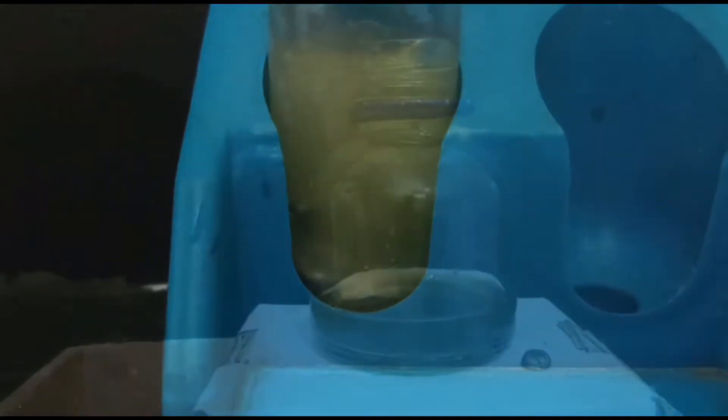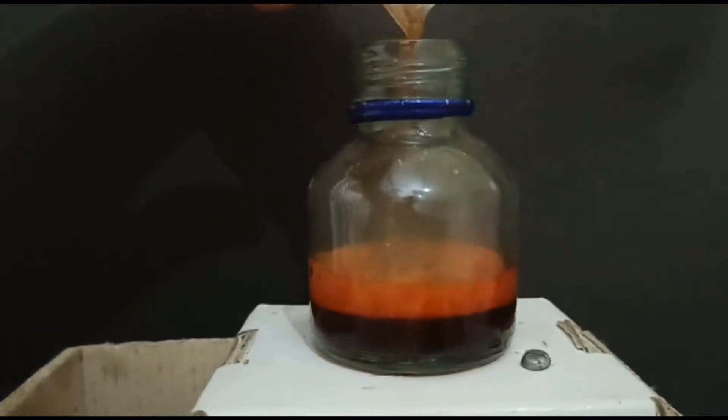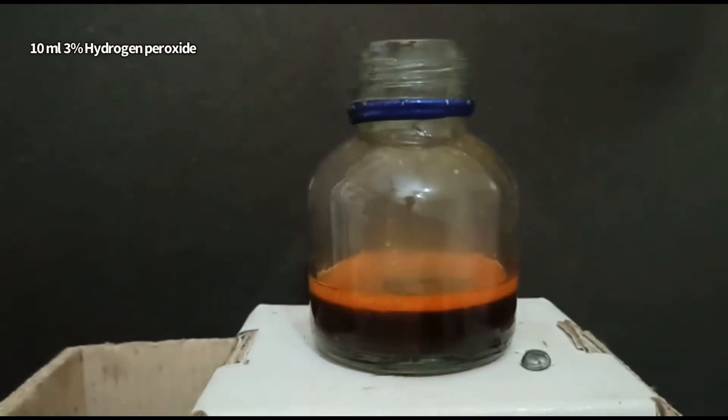About a week later, all the iron had dissolved, so I filtered the solution and transferred it to another container. Then I added 10 ml of 3% hydrogen peroxide. The hydrogen peroxide must be added slowly because this reaction is exothermic.